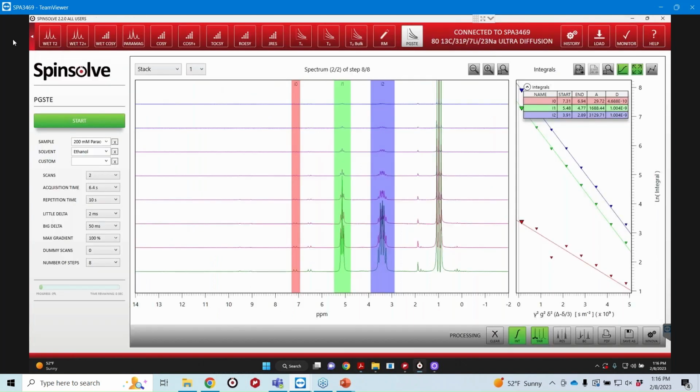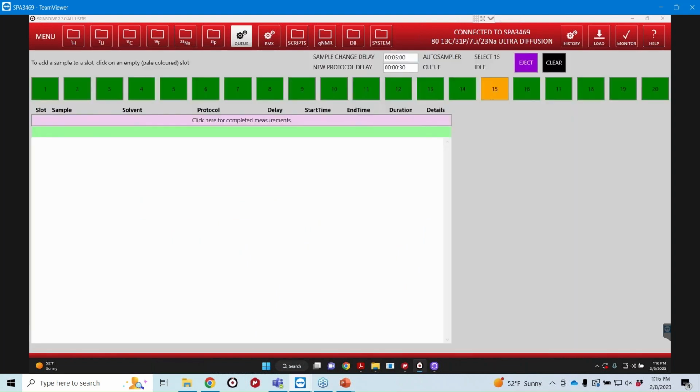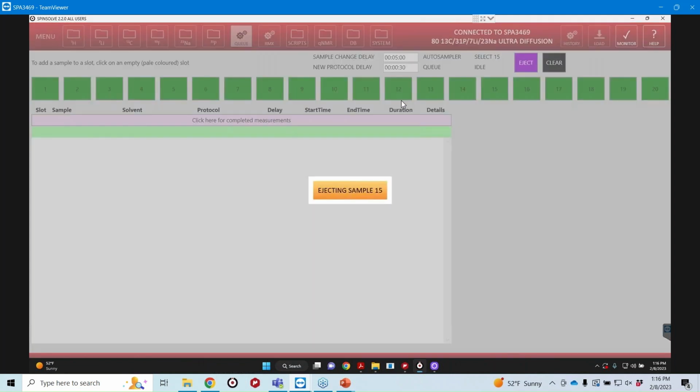So what we'll do next is I'll go ahead and prep the instrument for collection for another sample that will start while we're going through the rest of this presentation. Sadly, this sample is going to take a little bit longer to actually acquire in comparison to that 200 millimolar paracetamol sample, just because it's a little bit more complex. So I'm going to start the data acquisition while we go through the rest of the slides.